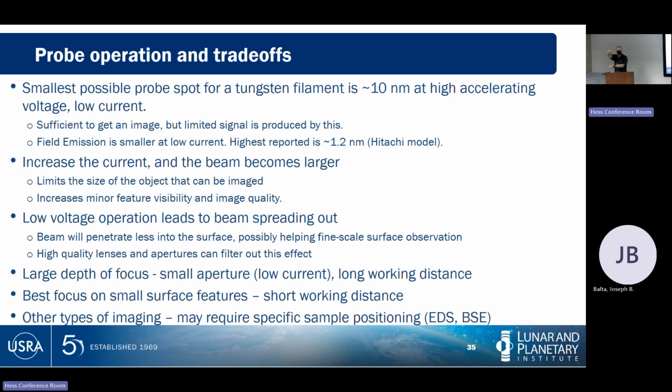You'll see as the week goes on in my various class versions of this, that there's a number of spots where while you're doing SEM analysis, you have to think actively about what you're doing. What is the signal that I want to get out? What analysis do I want to get out today or in this batch? And the answer may change as you're doing one analysis type to another. You may want more than one analysis type on a different sample.